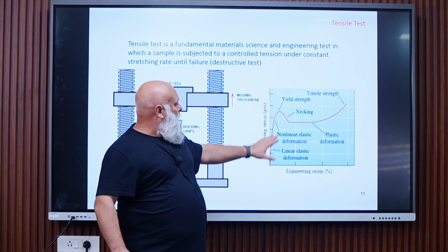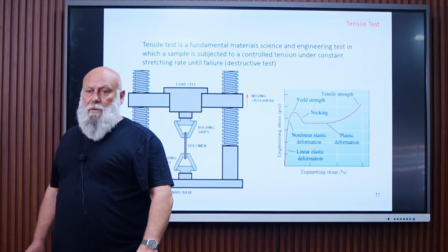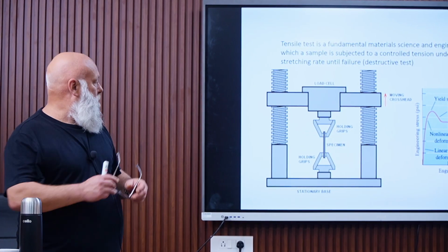Another information that can be obtained from this curve is from the area under the curve. The area under the curve corresponds to the energy of fracture of the material.